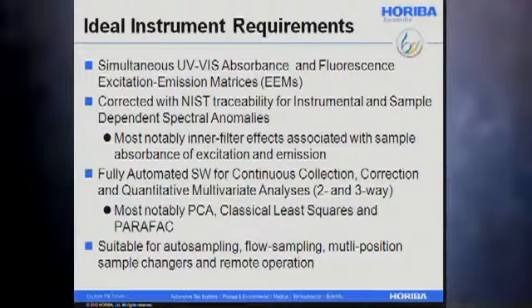And as I'll explain, the most important one, in terms of the wide dynamic concentration range from the natural changes in surface water concentration, is these inner filter effects associated with the absorption of the fluorescence excitation and emission portions of the spectra.